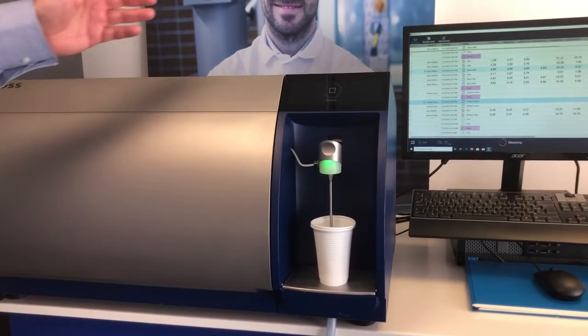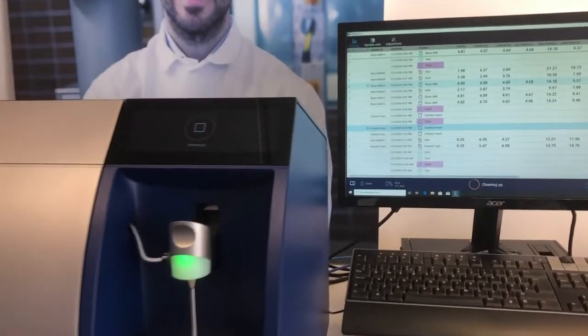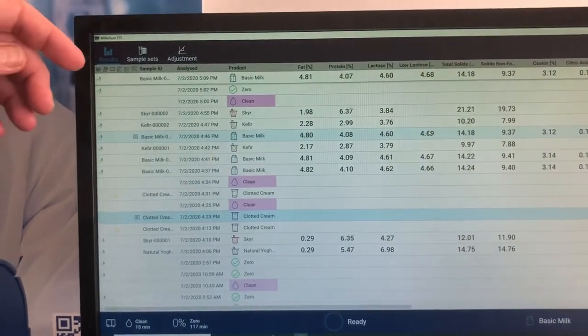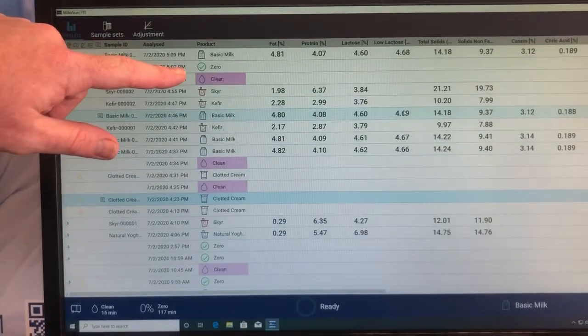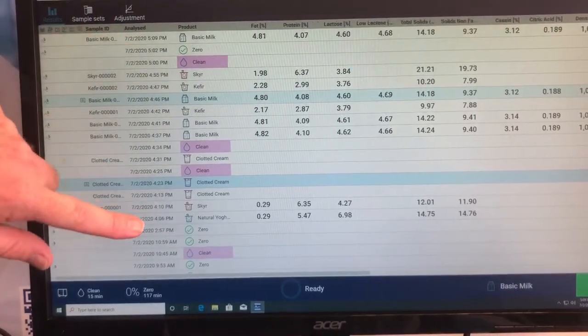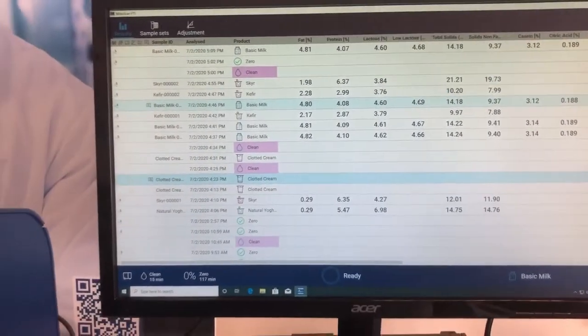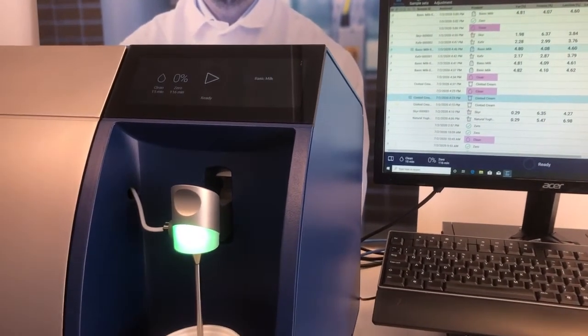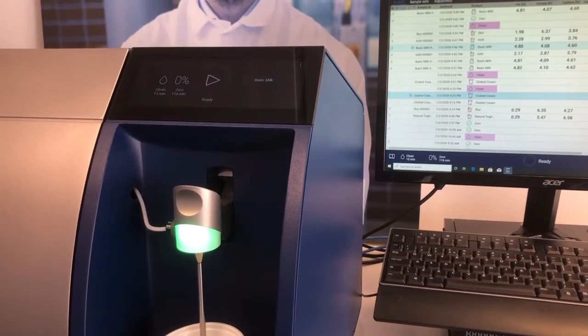If we take a look at the computer, we have an all new software system for the MilkaScan FT3 running on our Nova platform. As you can see from the zero times, it zeroes every two hours. This zero is a goldmine of information and allows us to standardise based on the slopes of the spectra.